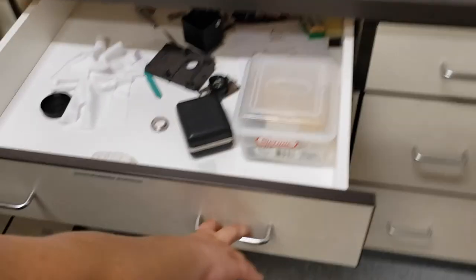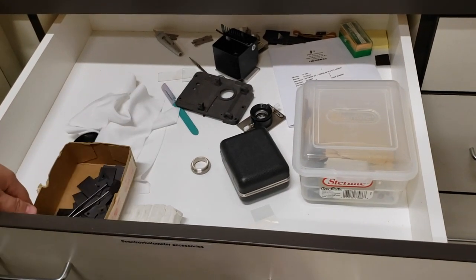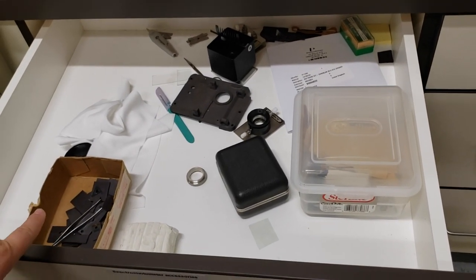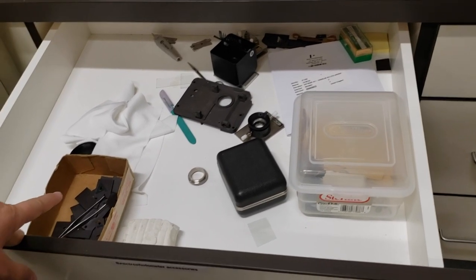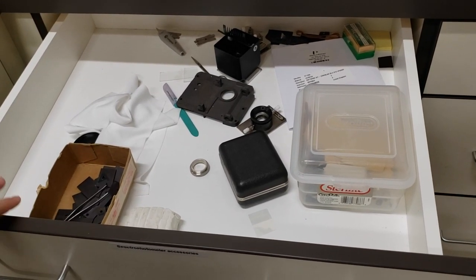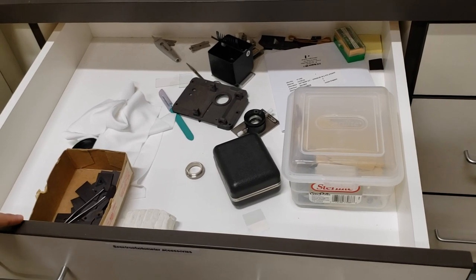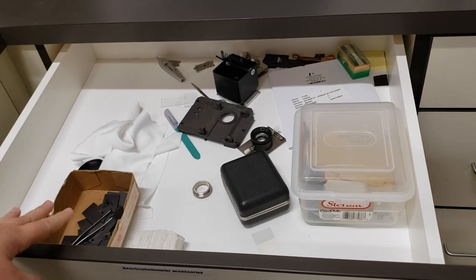The next drawer over has a bunch of random accessories, some of which are currently up on the counter. These are things you can use inside the UV-Vis, especially in the integrating sphere. The integrating sphere is good for solid samples, and if your solid sample is very small, you'll put on a slit or some sort of mask to keep the light specifically on your sample. These accessories help you rig up a holder that works well for whatever size of solid sample you may have.